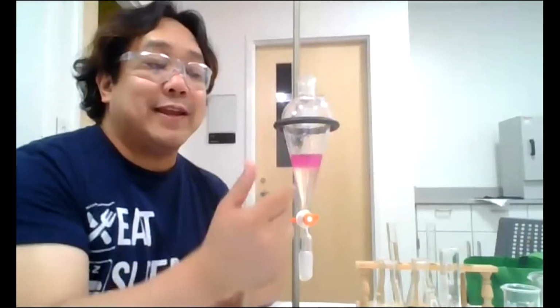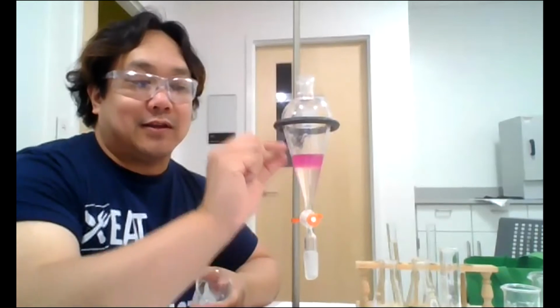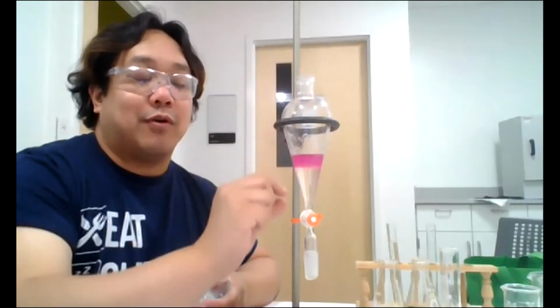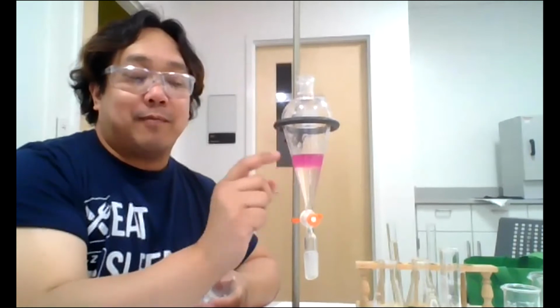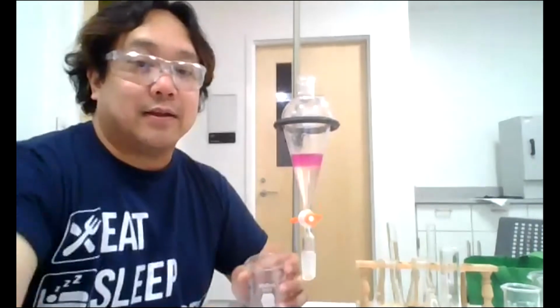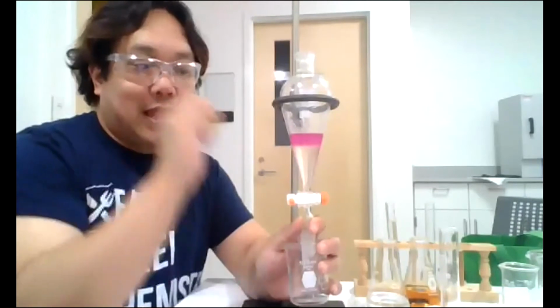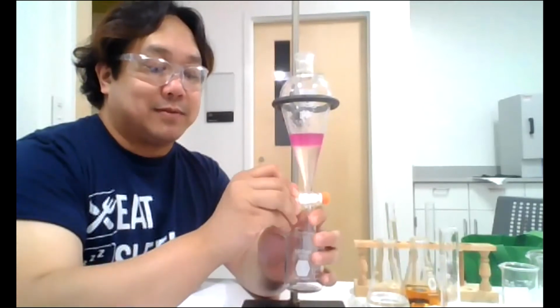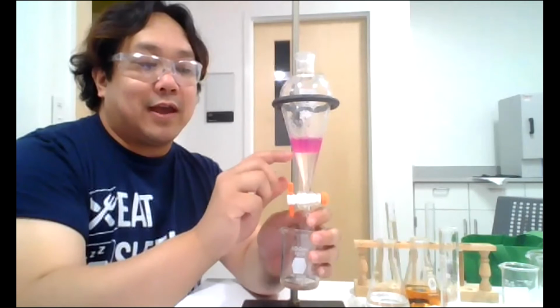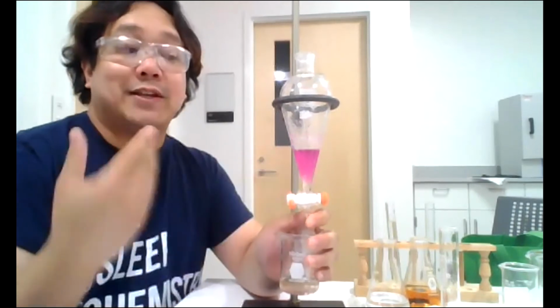And what am I going to do? The idea is I've got to re-extract this layer here. Now, the thing is, the way it's set up, because the organic layer is at the top, I can't get rid of this organic layer and rewash with new organic layer just by removing this top layer, because it drains from the bottom. So the idea is to drain and get that aqueous layer, most of it as possible.